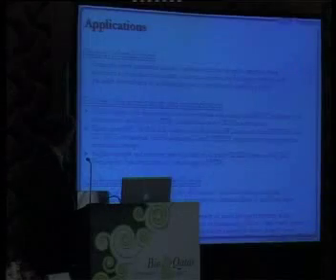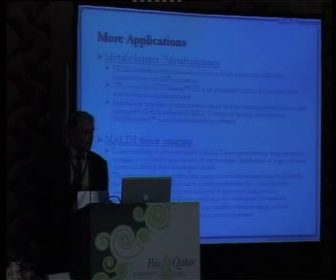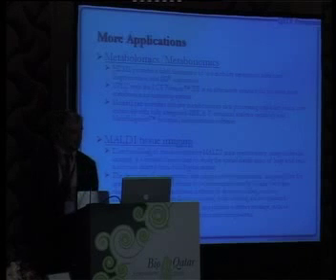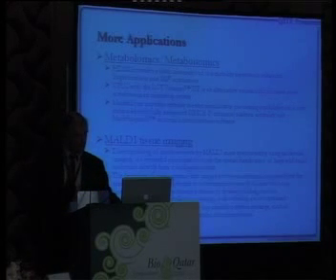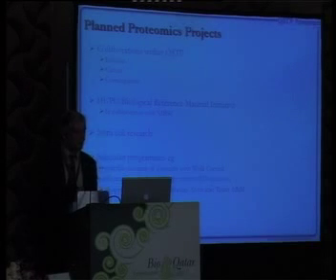You can see the high level of performance through those parameters. The applications which may be of interest in the Qatar frame is protein identification, characterization and quantification, conformation and ion mobility studies. We're also looking at metabolomics and even tissue imaging within the same system. This is a real workhorse capable of doing a wide range of different applications. So our planned proteomics projects are collaborations.